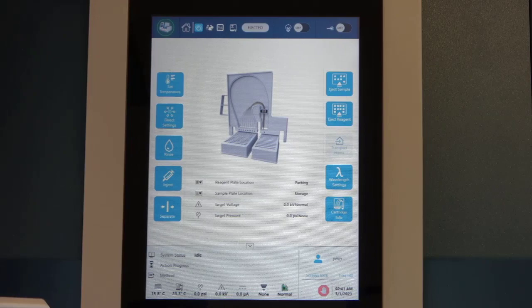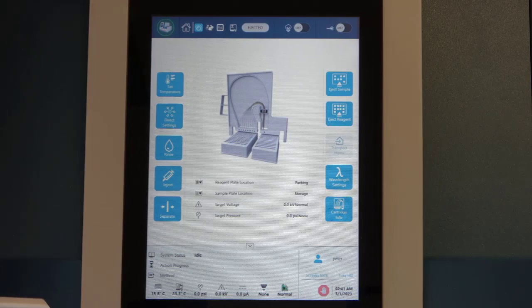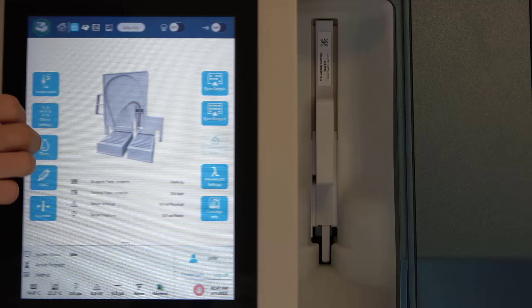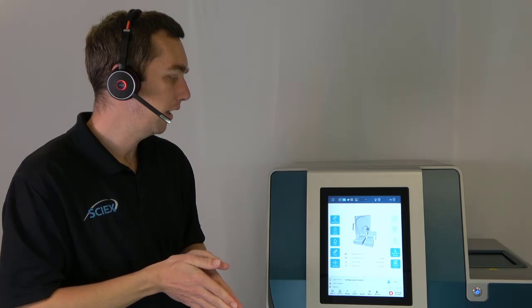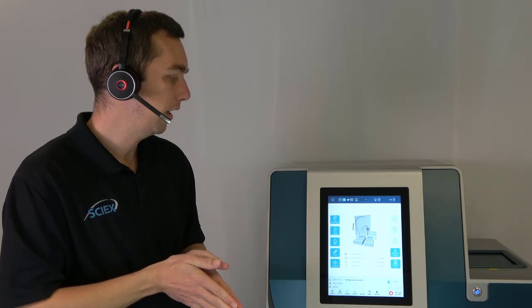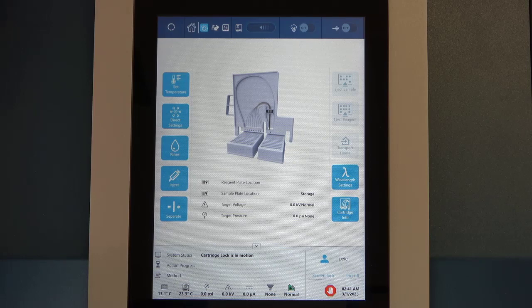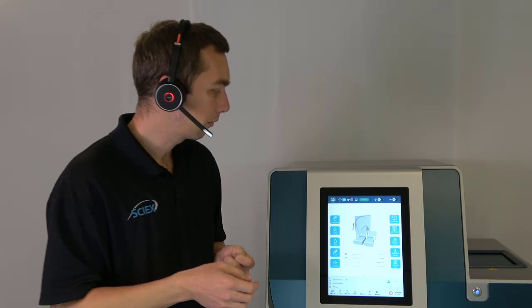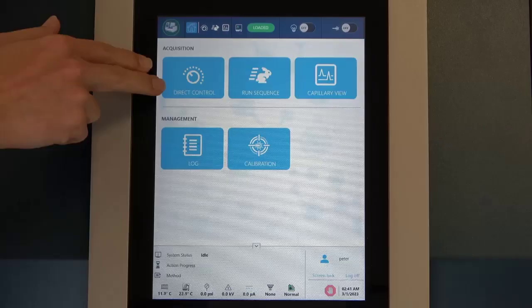Once that's done loading, we eject our sample plates. The sample plate area is cooled by coolant underneath to keep it at our set point. We put those in there correctly and click the button again to load the sample plate into its home location. Then we slide the front panel back over, take our cartridge, slide it right in, feel it click into place, and click the lock button — it pushes the cartridge against the side panel so the O-rings where pressure is applied are sealed up against the wall.